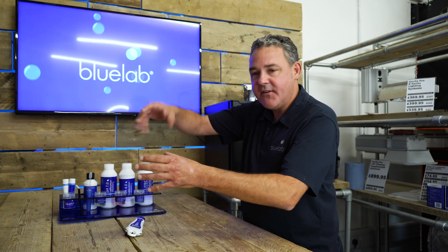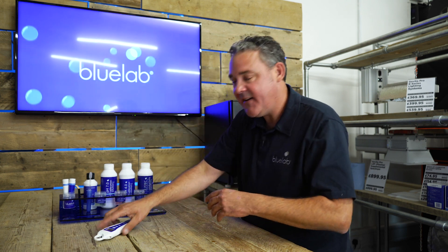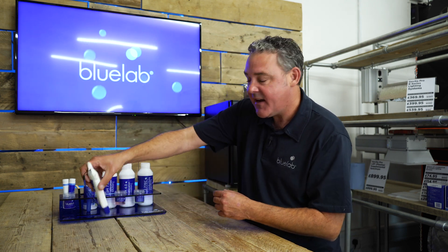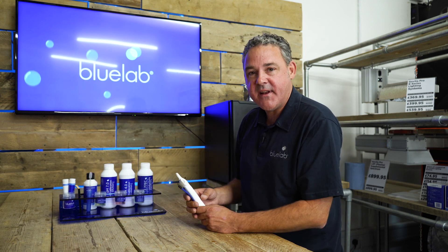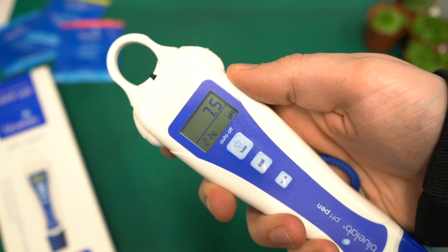This gives you time — you've got your handy acid in one hand, your pipette in the other, you're not fiddling around doing all this. You set it to float there, add in your acid, give it a quick stir with the pen and it gives you an instantaneous reading. It's backlit as well so it's very easy to use, and it also has a hold function.